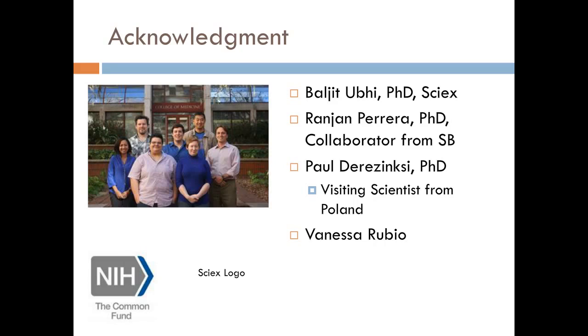Did you collect the MS and MSMS in separate injections, or did this platform allow you to collect the data together? This platform allowed us to collect the data in the same injection, so that enables us to use less sample or to save the sample for other things in the future, and then to use the information post-processing to dig out other information that's present. That also allows you to have fewer injections so that you can keep your instrument running on multiple projects in the future and improves our overall performance.